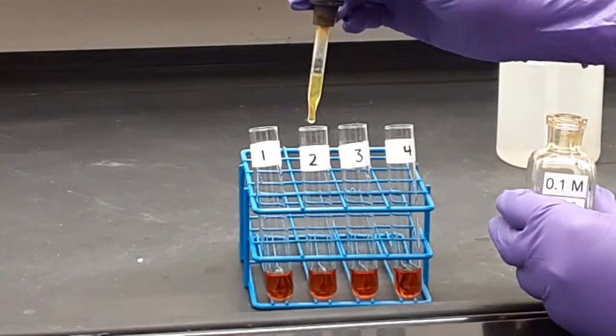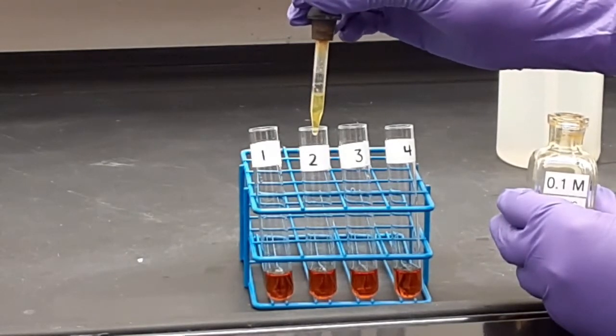So we're going to disturb the equilibrium by adding a little bit more iron.